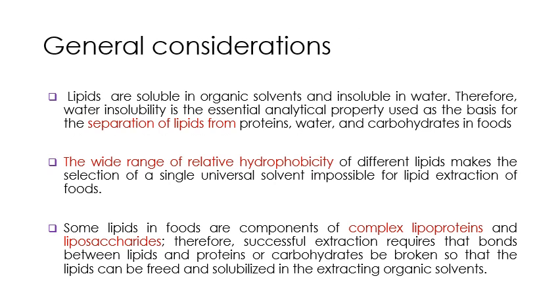We know that lipids are soluble in organic solvent and insoluble in water. Therefore, this water insolubility of lipid is the essential analytical property used as the basis for the separation of lipids from proteins, water, and carbohydrates in food. There is a wide range of relative hydrophobicity of different lipids that makes selection of a single universal solvent for lipid extraction of food impossible. Some lipids in food are part of complex lipoproteins or lipopolysaccharides, and this complex structure increases the polarity of the lipid.